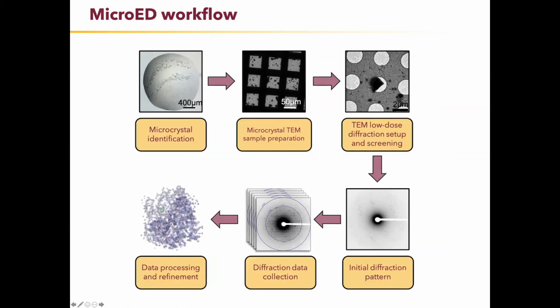So what does the MicroED workflow look like? Well, we're going to march through how you would conduct the MicroED experiment in this slide. And then again, there's going to be a much nicer video showing all these steps in detail. But the first step obviously is identifying microcrystals. And there's a lot of ways you can identify microcrystals.